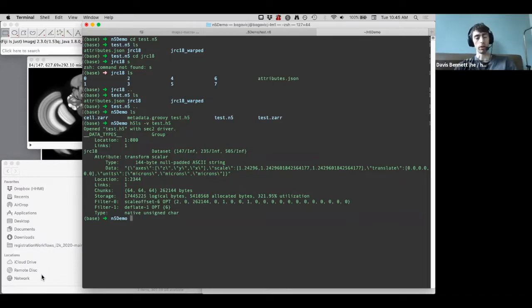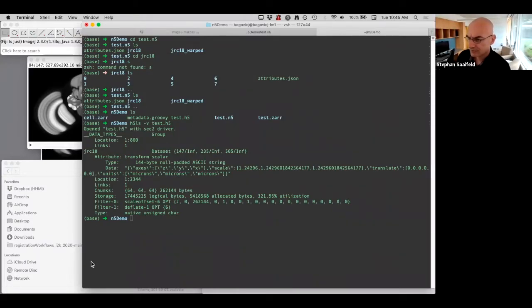Yeah, you can't put JSON metadata in HDF5 metadata unless you do some transformation of the JSON to make it essentially not JSON anymore. You would have to translate the struct from JSON. And JSON is not informative about what the actual types of the primitive elements are, because it has a limited set of types.